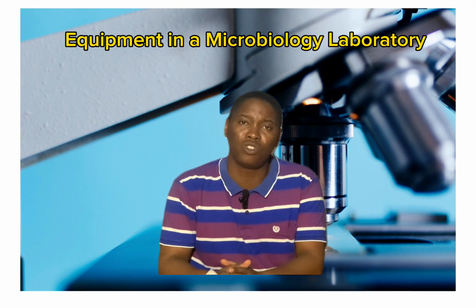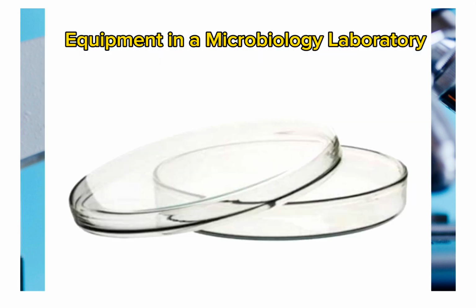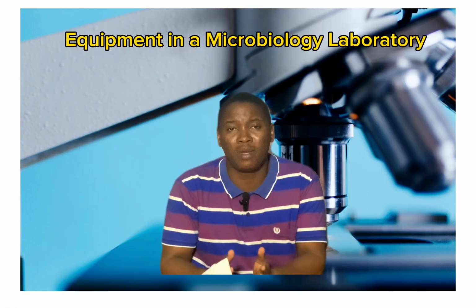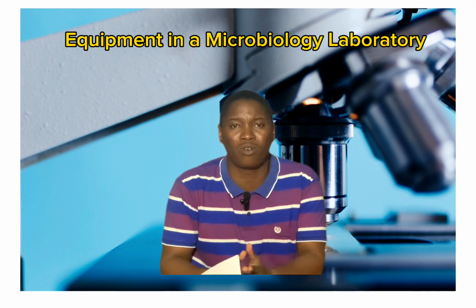Also, another tool that is used in the microbiology lab are the petri dishes. Now, petri dishes are little lid-like dishes that have lids, and they could be made of either plastic or glass. Within these little dishes, culture media are usually put, and then these dishes can be incubated in the incubator in order to encourage the growth of microorganisms.